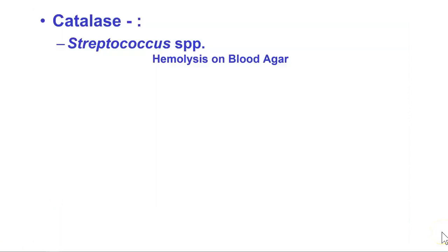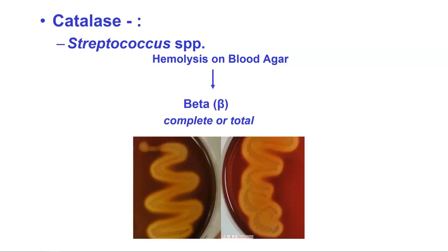Number one is how does it grow on blood agar? The sample is streaked, or inoculated, across a plate of agar that contains 5% sheep erythrocytes, or sheep red blood cells. The organism may produce hemolysins, which have the ability to rupture the erythrocytes, or to destroy the red blood cells, and produce a clearing on the blood agar.